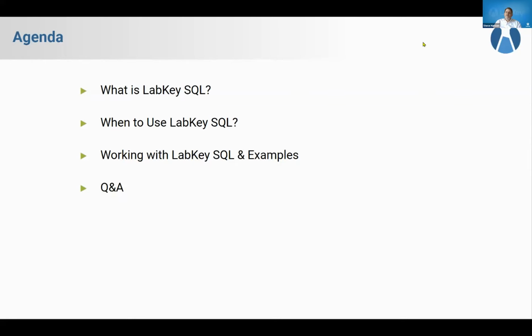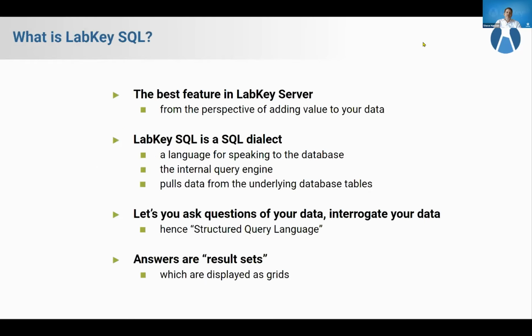And then let's really begin working with SQL. Where in the server can I engage it? How do I actually use it on my data? I'll have a few examples to look at, and then have a Q&A at the end. So what is LabKey SQL?